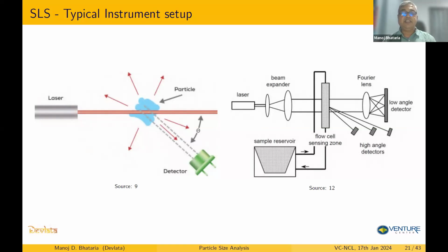Now the scheme which is presented first is most commonly used for measurement of molecular weight. So people who use a multi-angle light scattering setup and want to measure molecular weight, the instrument setup shown on the left is what is preferred because they can vary the angle. Okay. And the one on the right is mostly used for particle size analysis using Mie scattering or Fraunhofer diffraction.